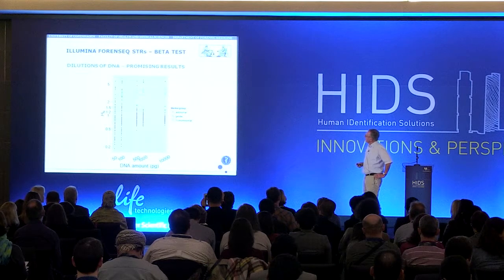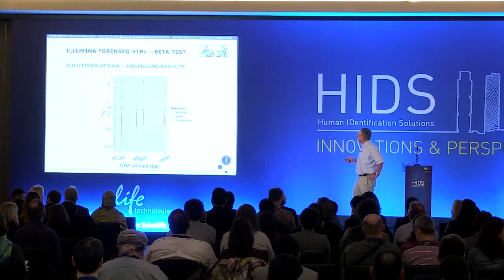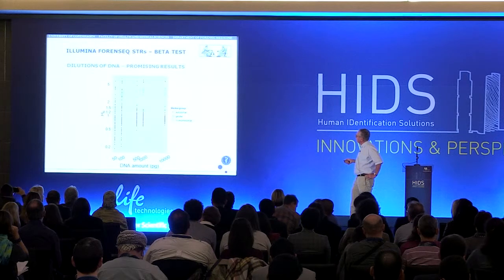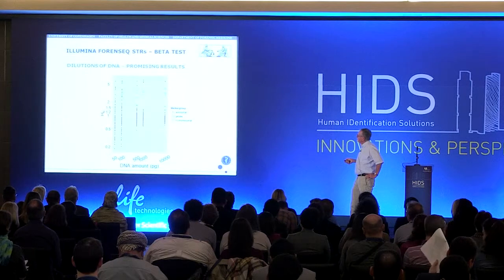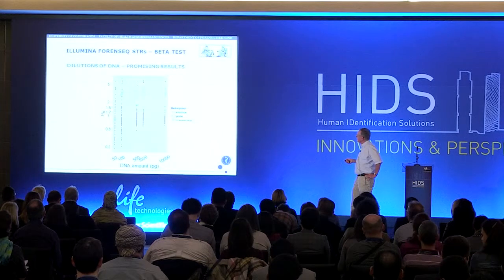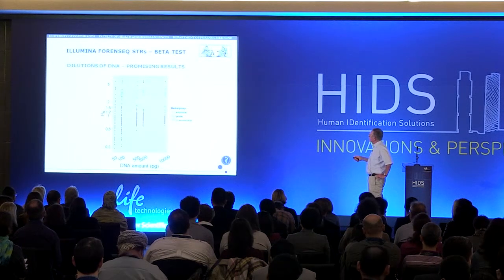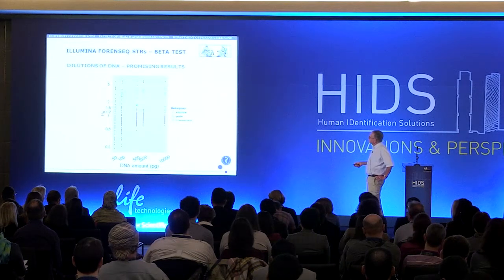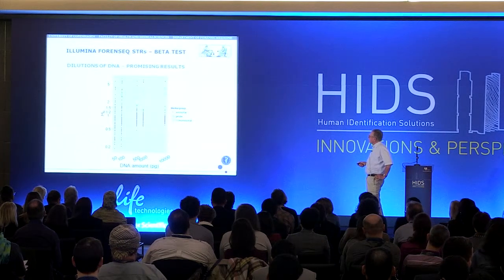And what about the sensitivity? Again, you can see the same pattern as you see when you do PCR and capillary electrophoresis, and you investigate the balance between the two alleles of a heterozygous individual. Then you hope for having a balance of 1-to-1. This is here. But in real life, you will see a kind of trumpet, so that the balance will be better and better until you reach somewhere between 500 picograms and maybe some nanograms.